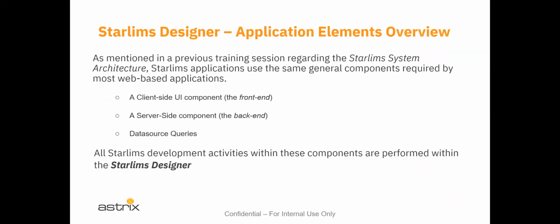So in previous trainings, the STARLIMS system was mentioned. We want to use the same general components required by most web applications. There's a client-side UI, the front end. We have a server-side component, which is known as the back end. And then we have data source queries and the alternative section for reports and advanced analytics. So all STARLIMS development activities within those components are performed within the STARLIMS designer.